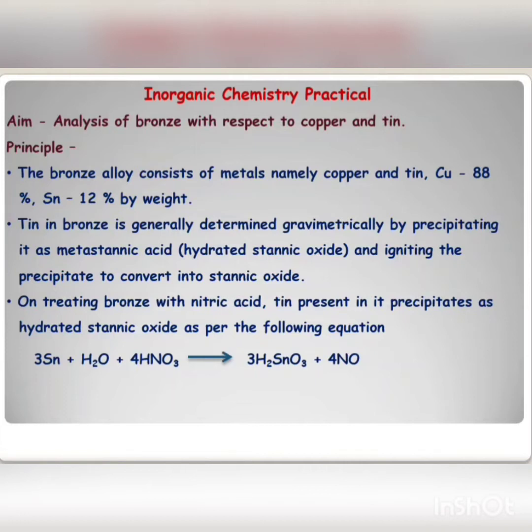Hello everyone. Today we are going to see an inorganic chemistry experiment. Here we are going to study how to analyze bronze alloy with respect to copper and tin. Actually, bronze is an alloy of copper and tin metals. These two metals are present in the bronze alloy.